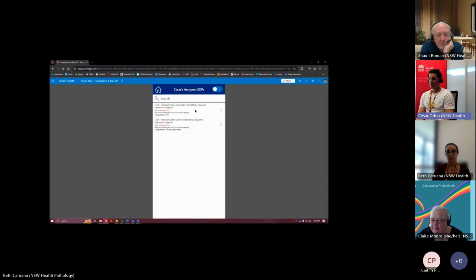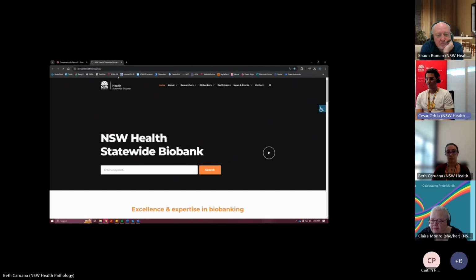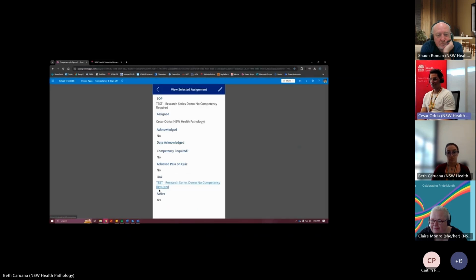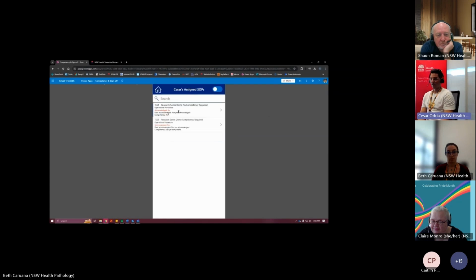And going back to our unacknowledged items, we can see here, view the details and click the link. Right now it's just our website, but you can edit that and say you've acknowledged it. You need to enter a date or it won't let you submit the form. So just entering a date, tick that, and it'll go away.